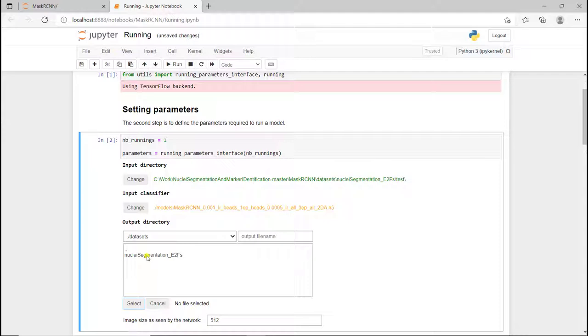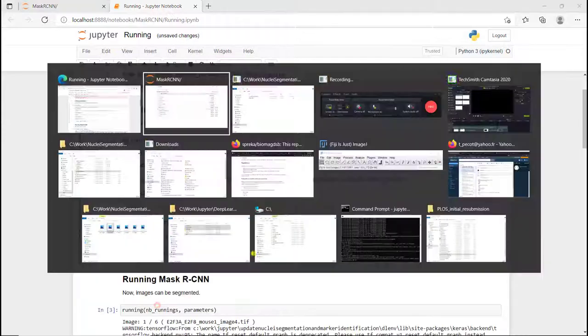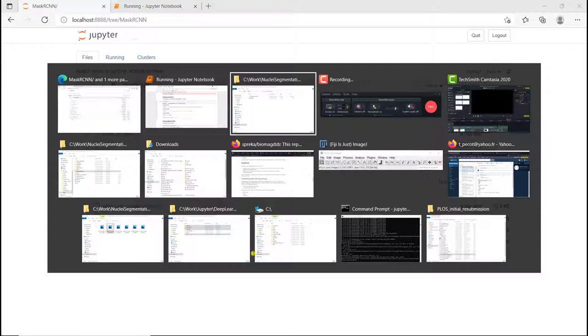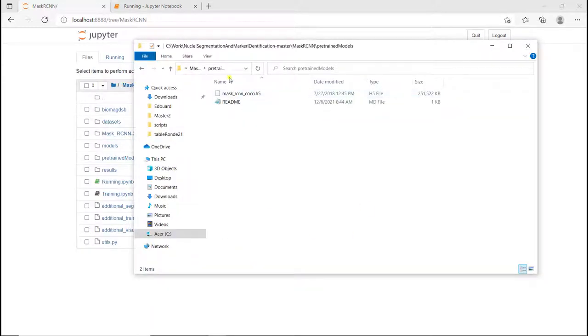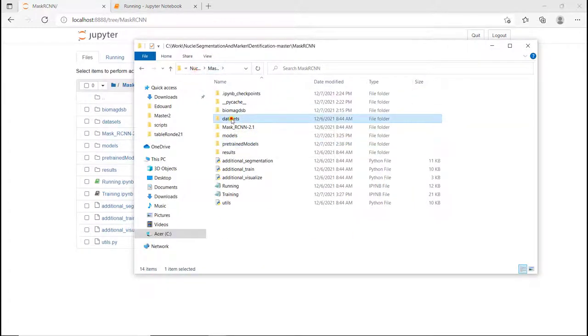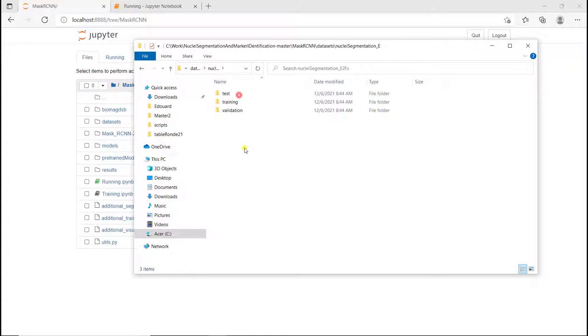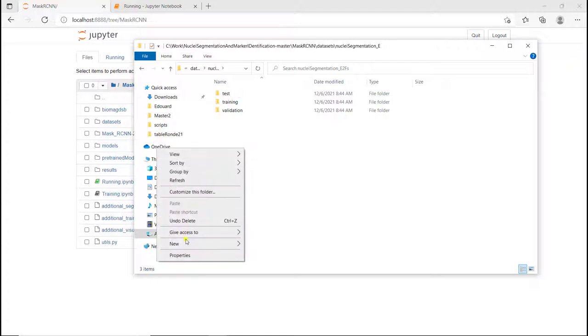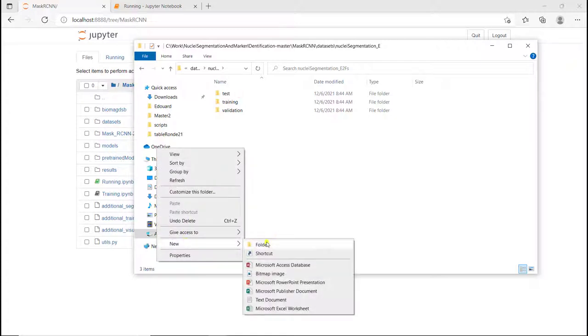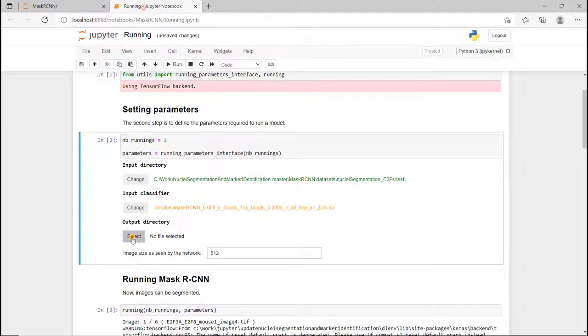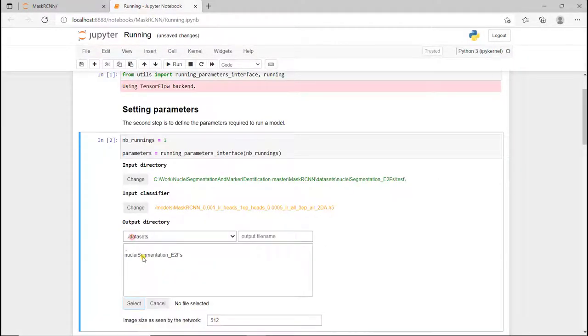And the output model. I didn't really define any folder. So I'm going to go back here to datasets in the nuclear segmentation. I'm going to create a new folder that I'm going to call results. And if I go back here, I'm going to define the output directory as results.